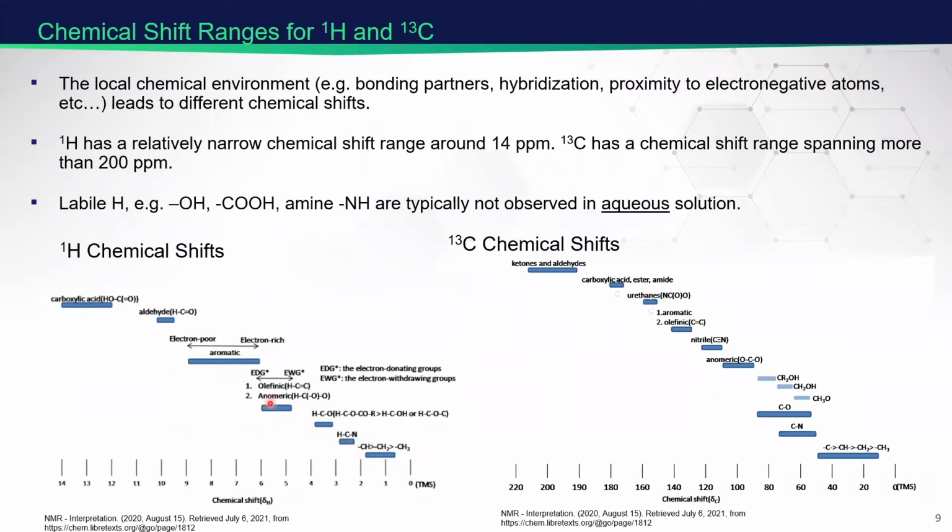typically occupy here. Now, carbon 13, the NMR active isotope of carbon, has a much wider chemical shift range. It's a second row element, more electron density around it, and it's much more sensitive to this. Unfortunately, it's not a very receptive nucleus compared to the proton, so we tend not to measure it directly in most NMR metabolomics. But there are indirect ways to get its information at natural abundance.